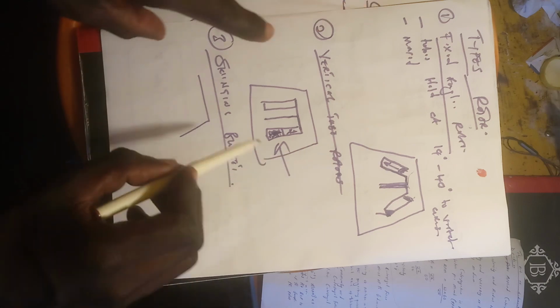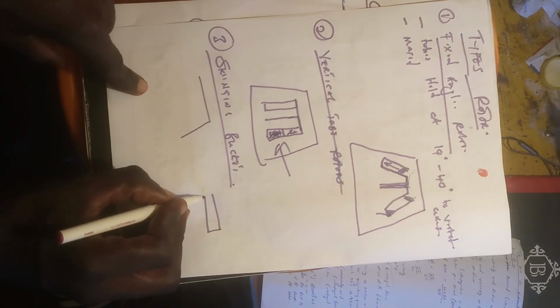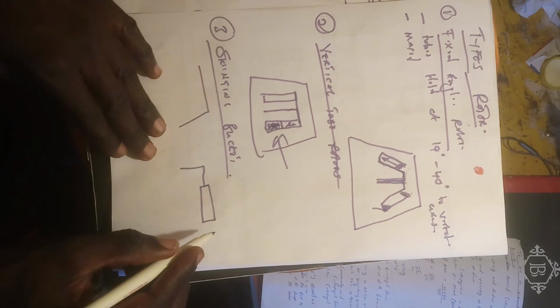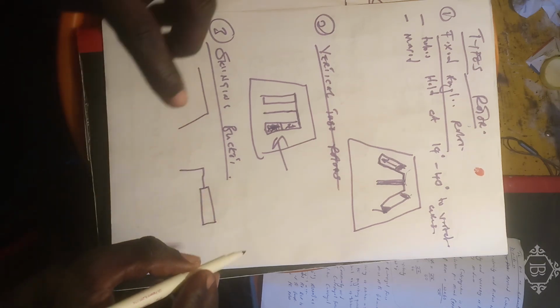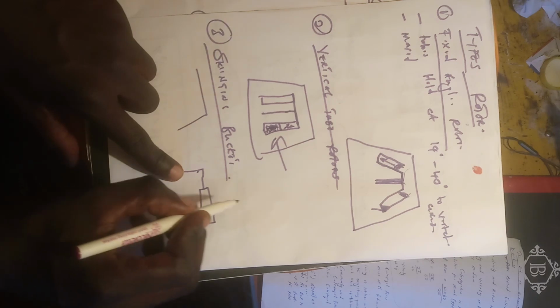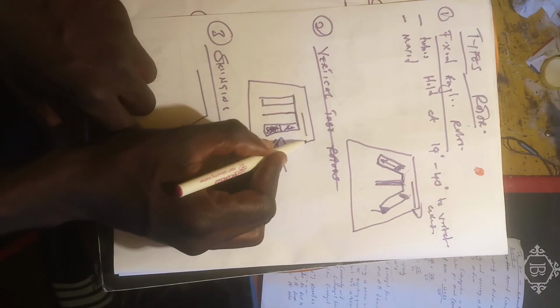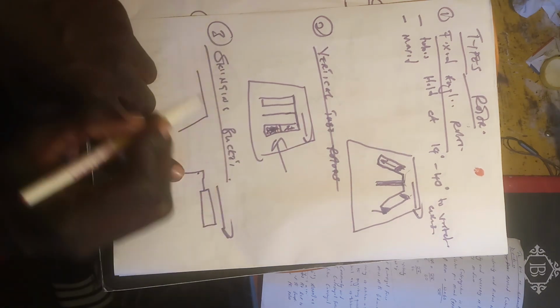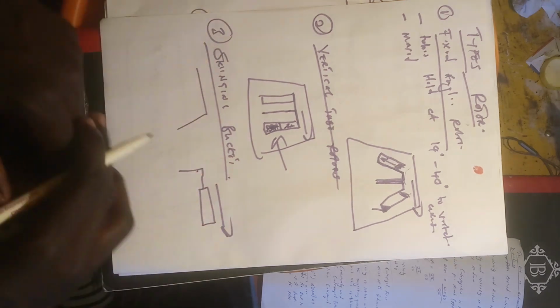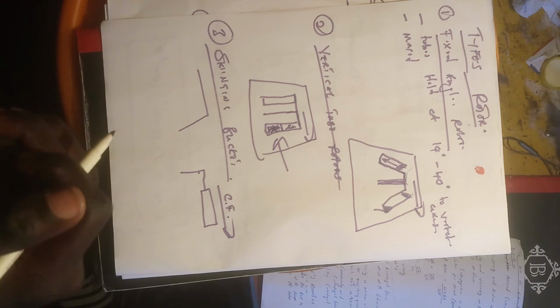But when acceleration starts, the tubes swing out and they become horizontal to the rotor axis. They swing out, they lay like that. We know that the centrifugal force here is like that, here it's like that, and in here it will be parallel to the tube.